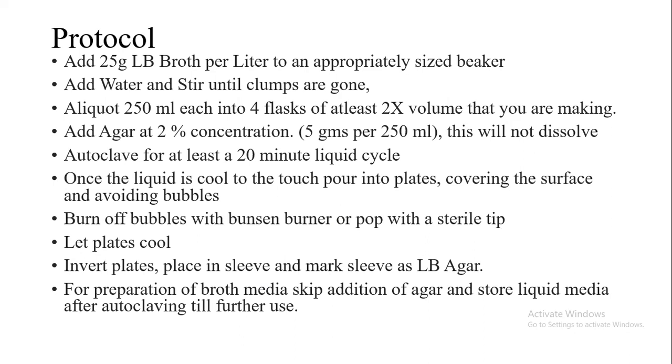After that we let the plates cool down. Once the plates are cooled, we stack them and keep them in an inverted position in the sleeve for further storage until any further use.